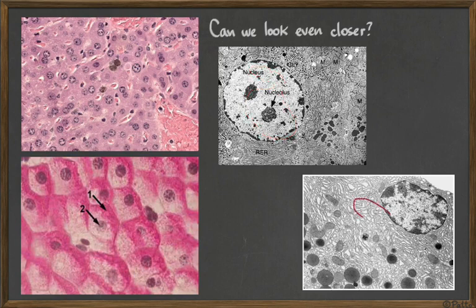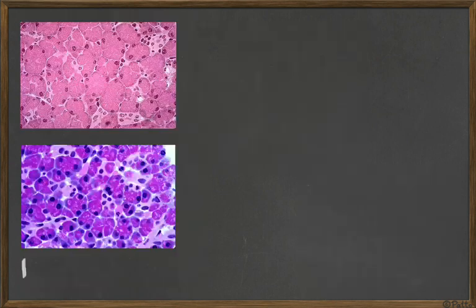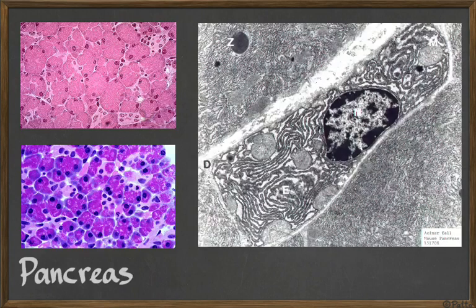And here we see even more structures inside of the cell because we are magnifying it even further. Here on the left, we have the pancreas seen in an optical microscope. And here you have those same cells seen in an electron microscope that can magnify even further. We see that this black and white image on the right has a much bigger magnification and resolution.